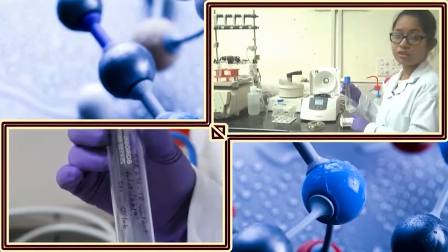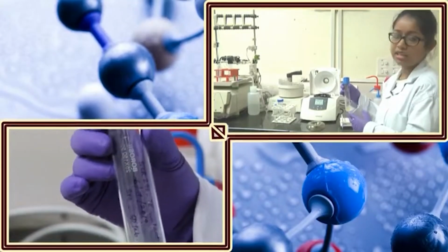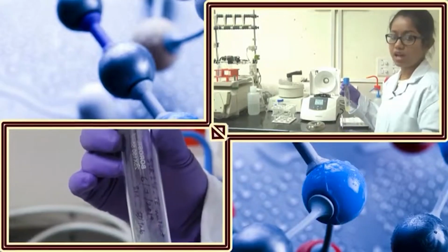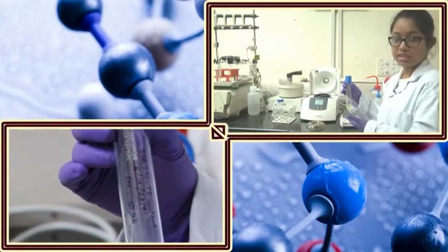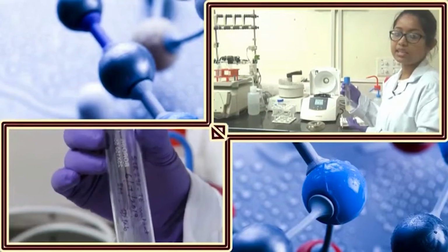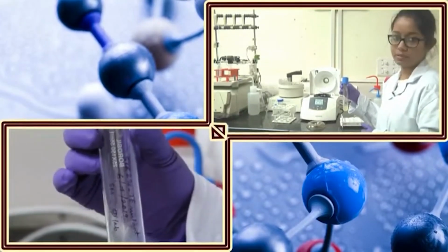So it is always a good practice to label the sample properly. It is not only for the culture, in any kind of solution or any kind of buffer you are using, any kind of bottles you have, always label them properly. Otherwise it might create a problem, because today you might remember what it is, but after 2 days or a few days you will forget what it is, and then it might create confusion for yourself. So always label your sample properly.